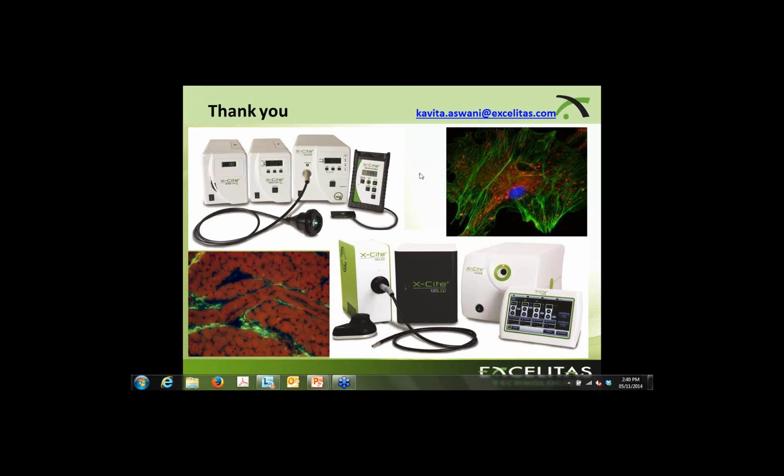And John asks, X-Cite 120Q power versus 120 LED across the spectrum. I think he's asking for a comparison. That's a good one, and we get that one a lot, actually. It entirely depends on the fluorophore. So if you're looking at DAPI, for example, some LED systems could prove more powerful than your 120Q systems.